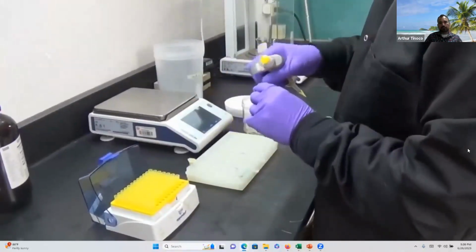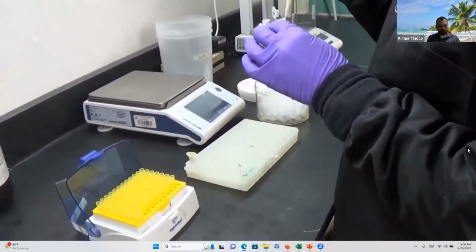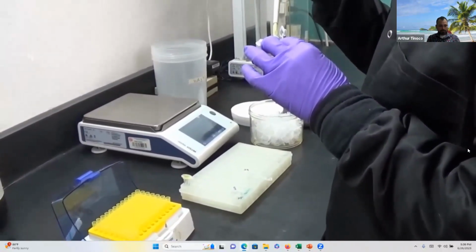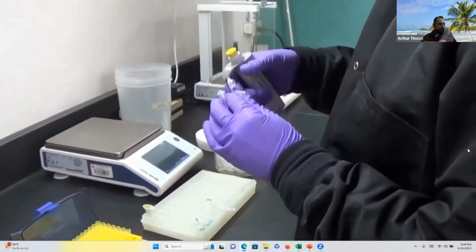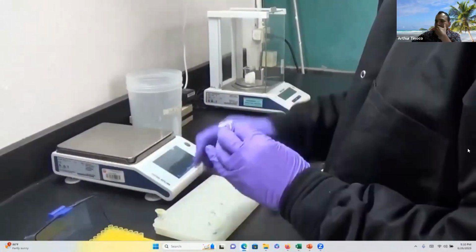I then prepare the final set of solutions by combining the matrix solutions with the small compound solutions. To do this, I pipette 5 microliters of the matrix solutions into 2 different epis.